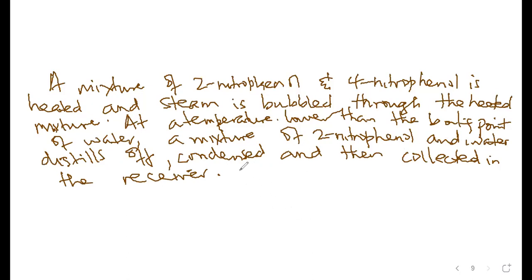Okay. So if you collected it in the receiver, then you have to purify the mixture by getting off the 2-nitrophenol from water. Remember, this one is now remaining as the residue. Are we together? Because it's an impurity, we don't want it. Are we together?